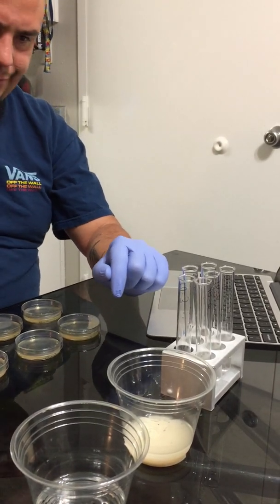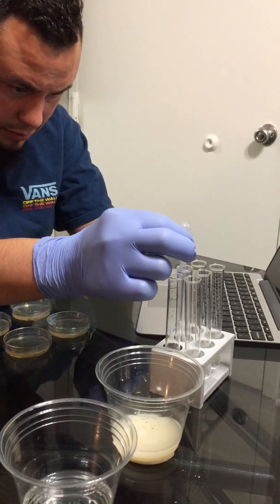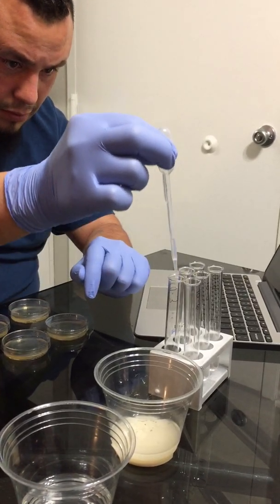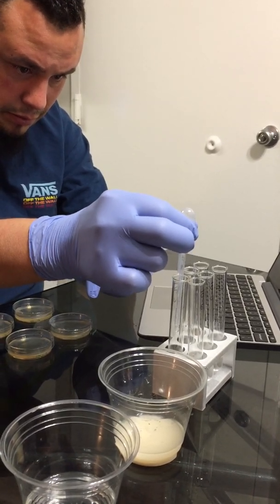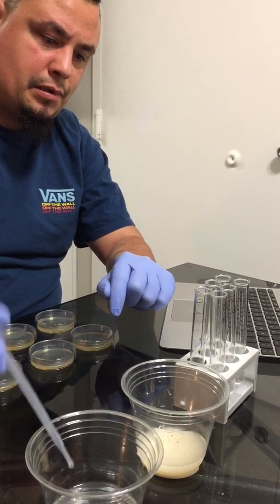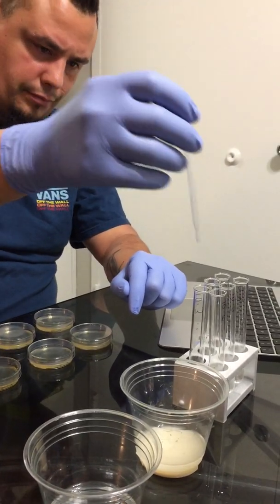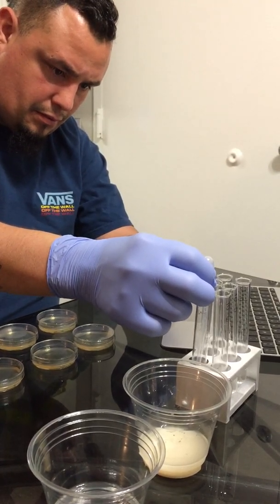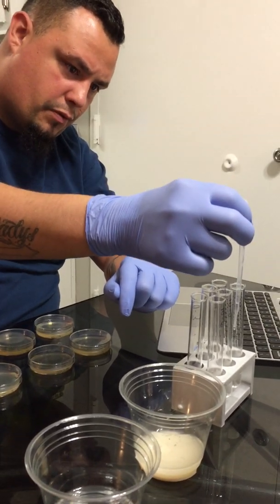And we're going to do the same thing. And into tube number 3. From 3 to 4.